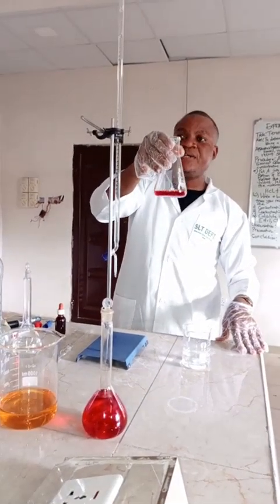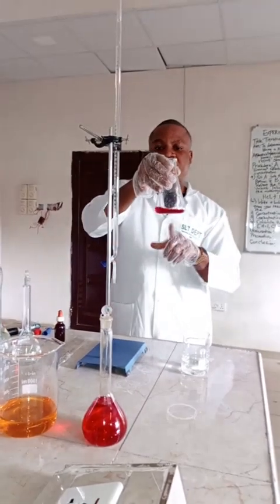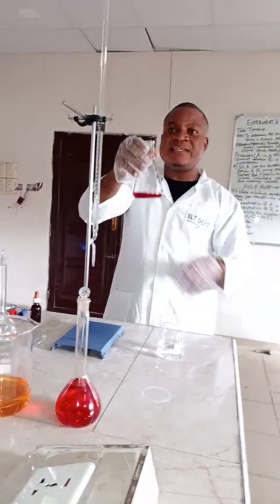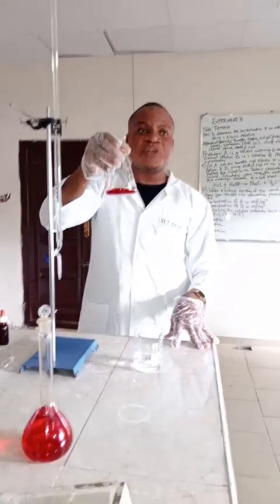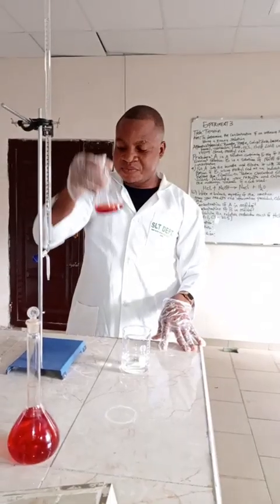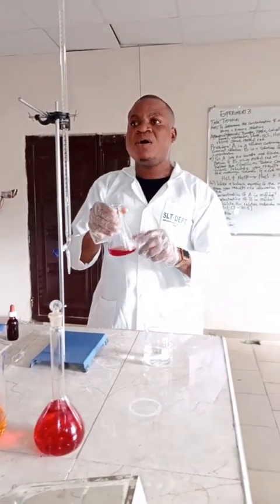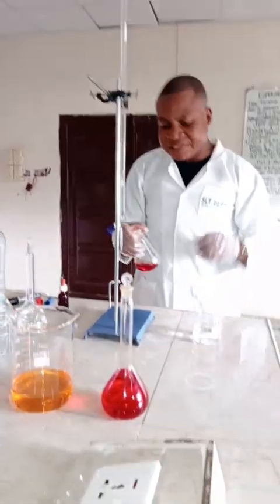This is a red color. The indicator material is red in color when introduced into the 25 cm³ of the base. And this is what we have. Note this color so that you can detect your color change during titration.